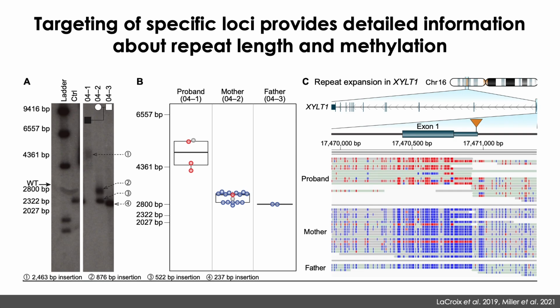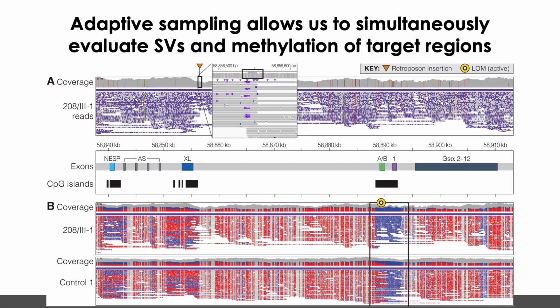This was one of my earlier runs, which is why we didn't have such great data. Also, the methylation calls were done using Nanopolish, which didn't always convert the reads. So that's why some of those gray bars are still gray, and they're not red, which means methylated, or blue, which is unmethylated.